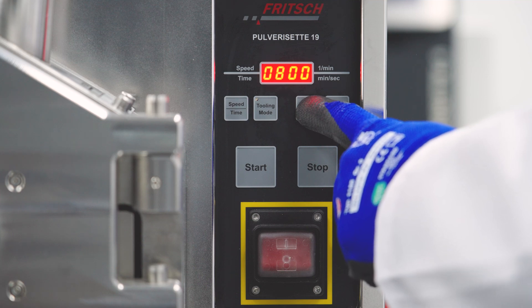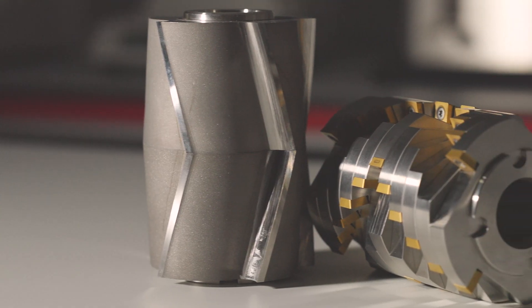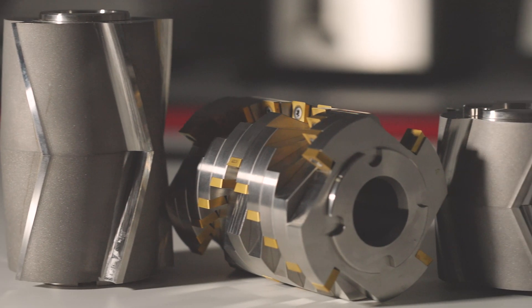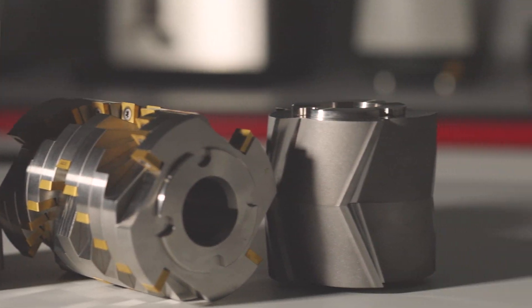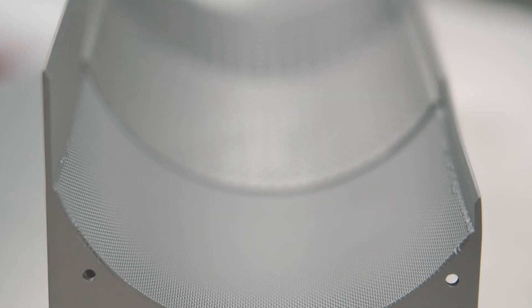Adjustable speeds from 50 to 3,000 rotations per minute, combined with a wide range of rotors and sieve inserts ensure reproducible results from 0.1 to 20 mm.